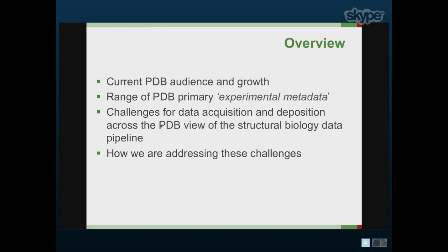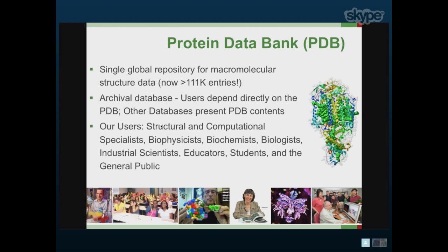So I'm going to focus a little bit on talking about the experimental data collected by the PDB, the challenges that we are confronting collecting data from the user community and through our deposition interface across the whole PDB structural biology pipeline, at least the view that the PDB sees, and how we're addressing some of the challenges that are part of that. So to begin with, I think everybody is familiar with the PDB. The molecule on the right is what most of our end user community is interested in.